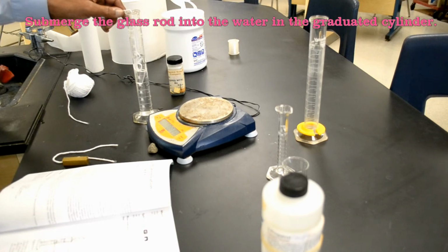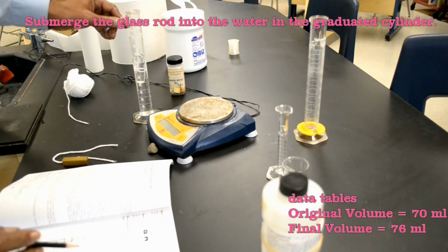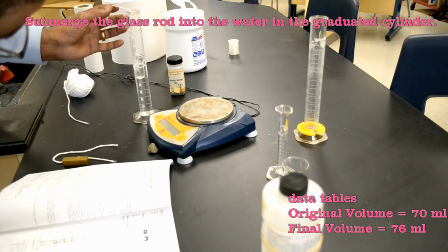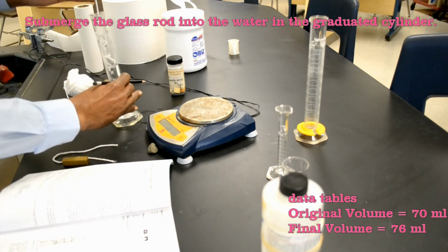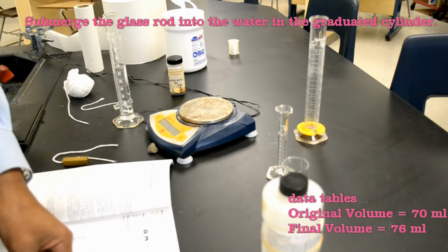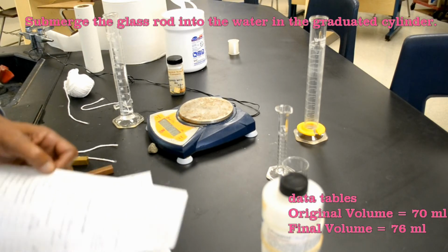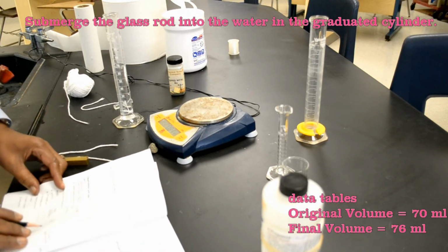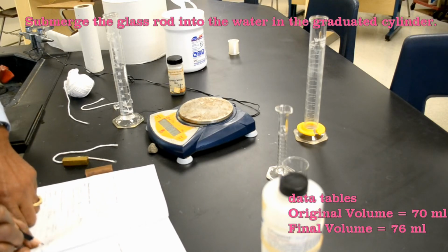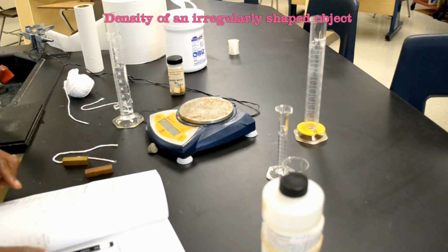Do not allow it to touch the sides or the bottom of the cylinder. I can't really stop it from touching the sides, but I can stop it from touching the bottom. Read and record the volume. The volume is about 76 now. Original water level was 70, final water level 76 milliliters.